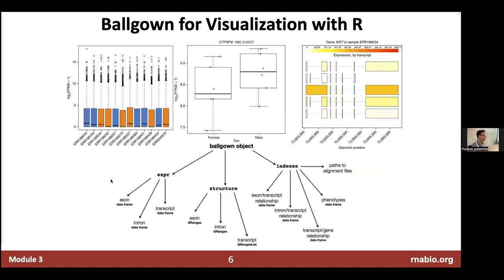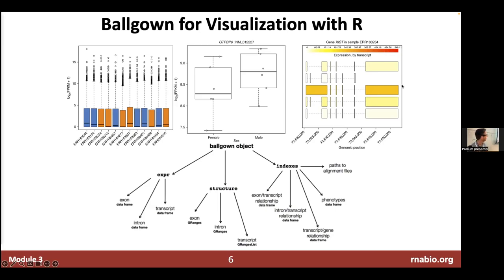Ballgown also comes with a bunch of visualizations, which we'll probably look at today. That's one of the reasons we've included this package — it allows you to quite quickly get to some nice visualizations, especially transcript-level visualizations that might be a bit of work to produce on your own. It can show you not only expression levels of genes overall, but also individual transcript levels, so you can see which particular isoform with which structure seems to be more highly expressed and explaining most of the expression from a gene locus.